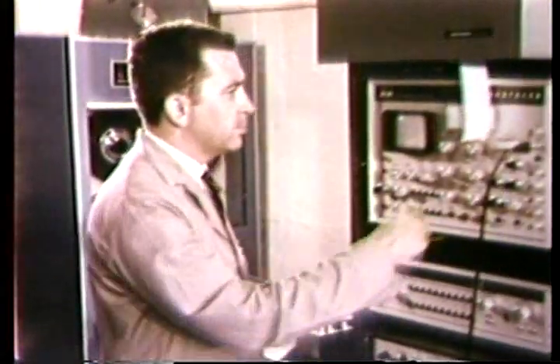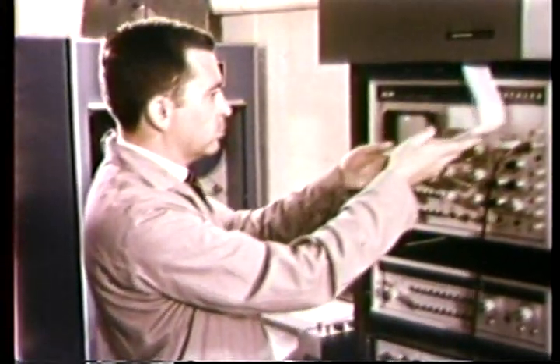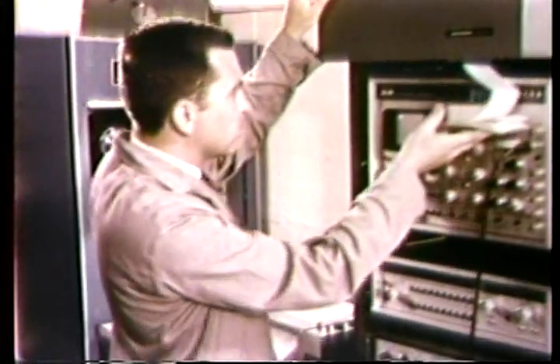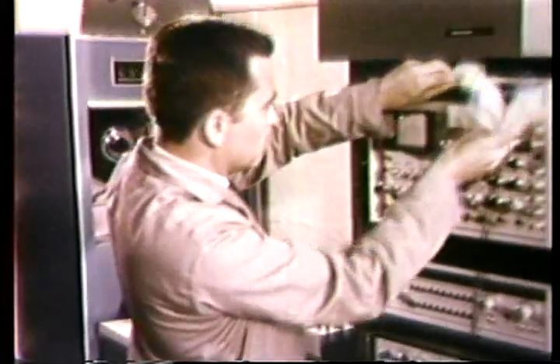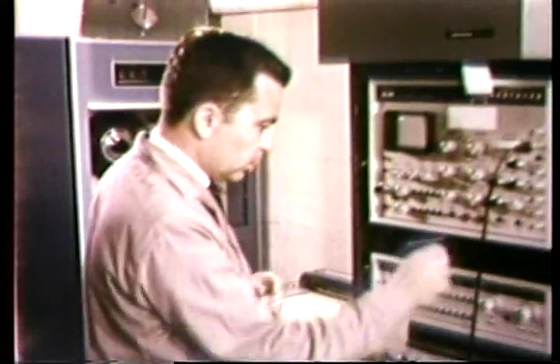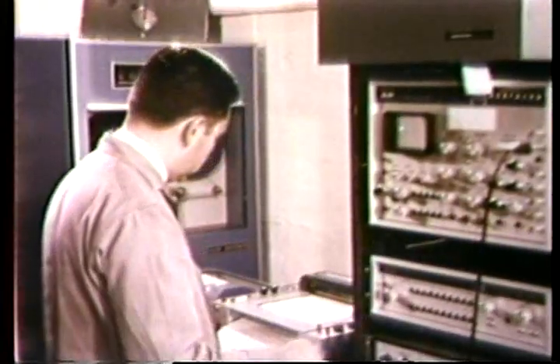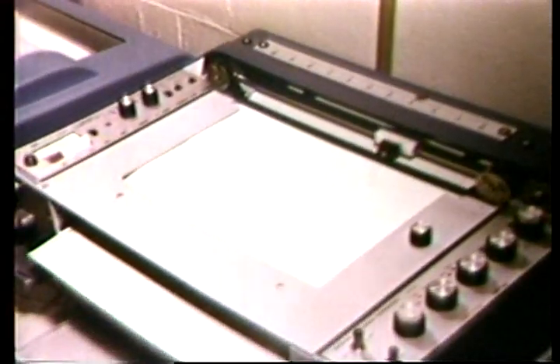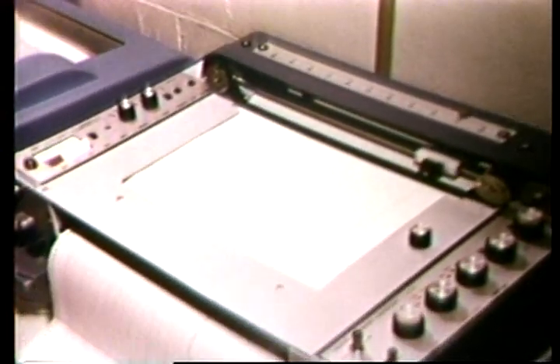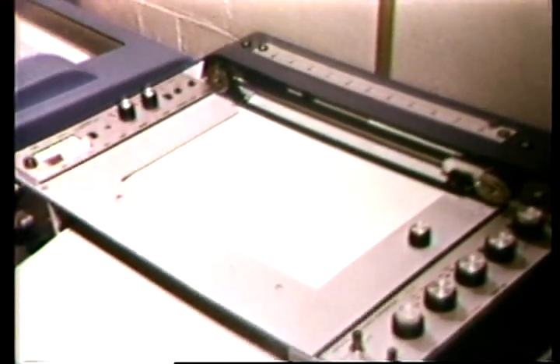Data accumulated by the analyzer is printed out in numerical form for use in calculating the amount of arsenic present. The arsenic content of the bone sample submitted was significantly higher than that of normal human bone. This finding, of course, is of prime importance in a suspected arsenic poisoning. The analyzer also produces a permanent record in chart form. The analysis was quickly and conveniently accomplished in the FBI laboratory, employing the great sensitivity of neutron activation analysis for the detection of arsenic.